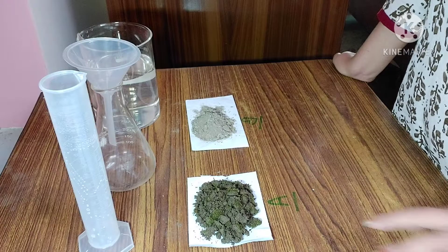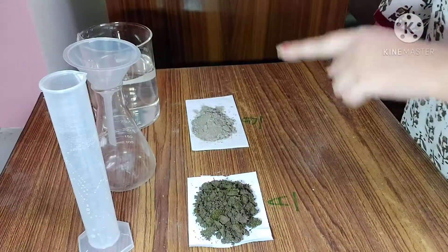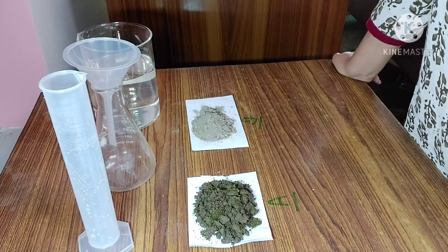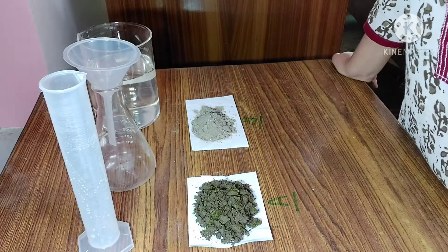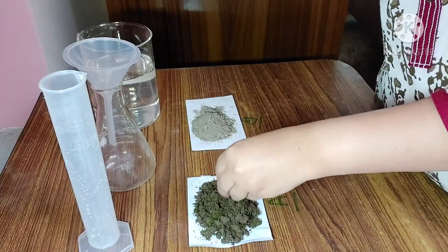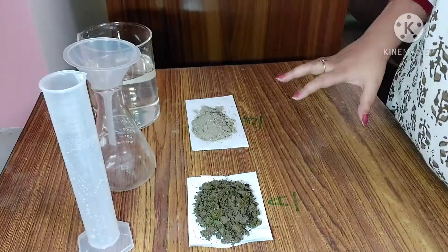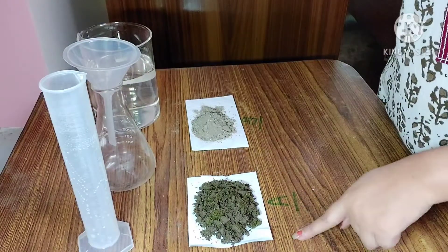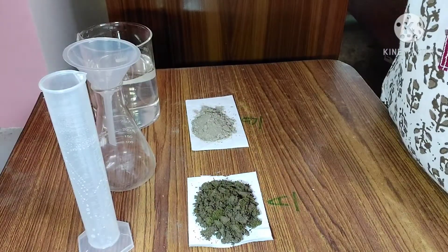Here I am using two types of soil sample — Sample A and Sample B. First of all, we will have to study the texture of the soil sample. By holding it in our hands, we can feel the texture of the soil. We will also have to study the color of the soil. You can find that Sample A is dark in color and Sample B is light in color.